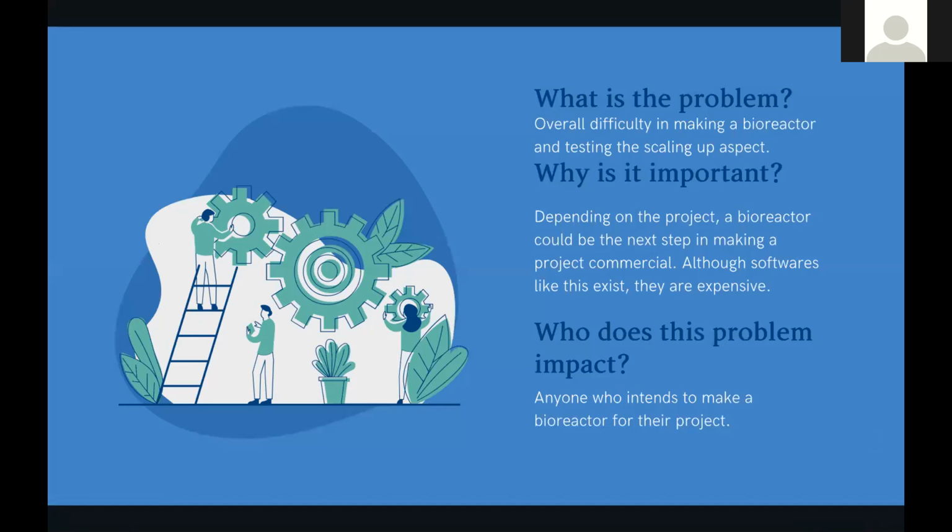So we think that even if you have the scientific aspect, scaling up should be more frequent and more important and stressed on. Even though there are softwares that focus on parametric modeling and do have this already, they are quite expensive and they need licenses, especially ANSYS. So we think that anyone who intends to make a bioreactor for their project to test scaling up could make use of this biofoundry.